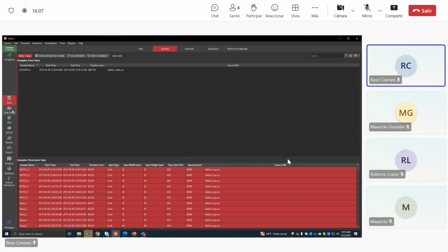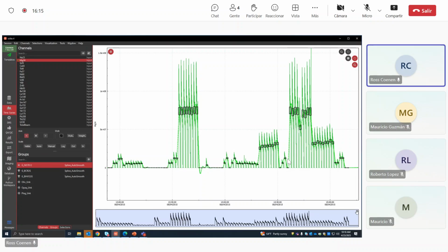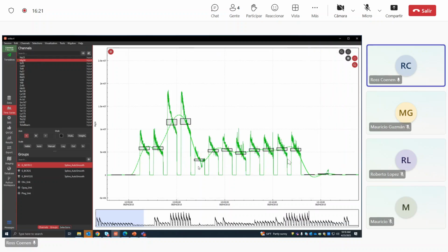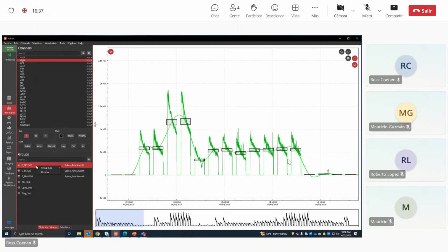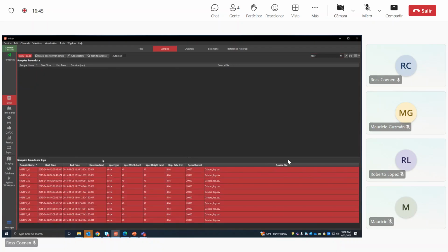Okay. Back in time series, we see our baseline group. And that does not look the way we want it to do. It looks like it's on the samples. And it's because I hit -10, but still included everything. So I'm going to go back in and create it again. Oops, I wrote over the NIST 612. Accidentally called it NIST.